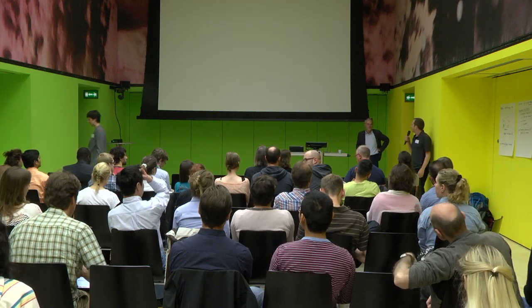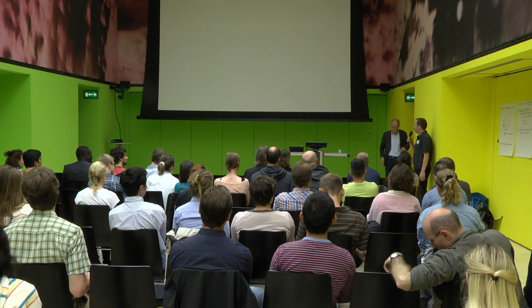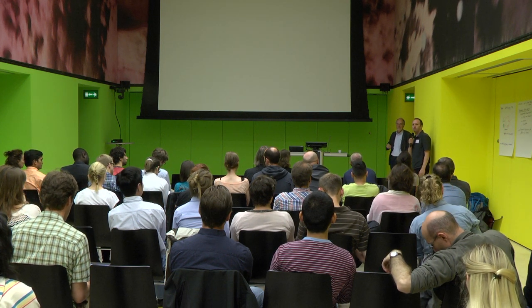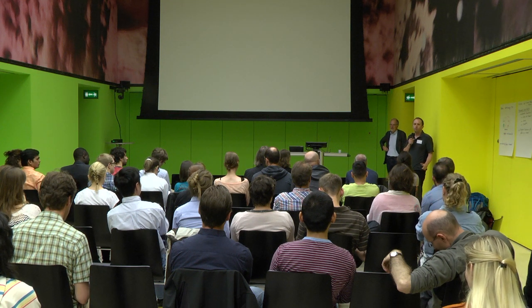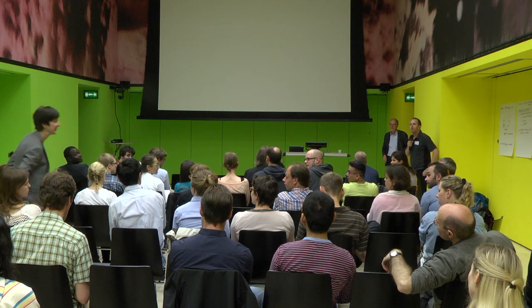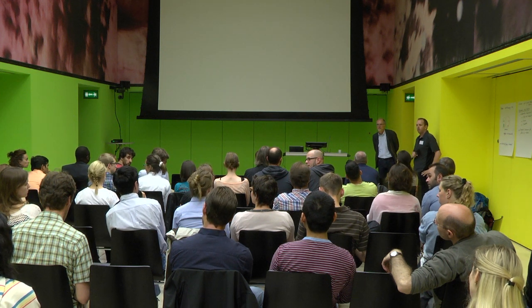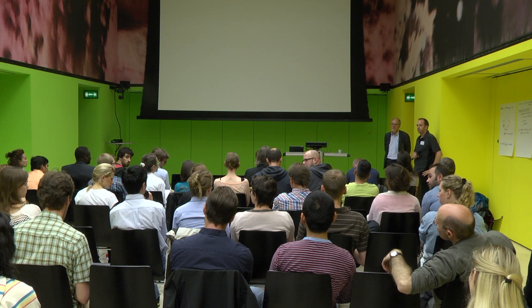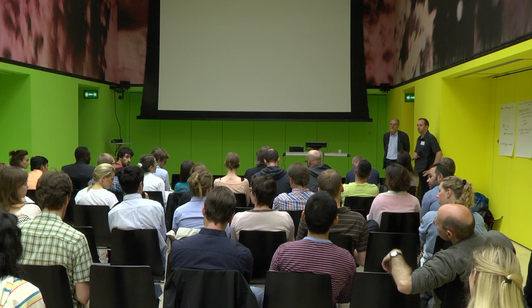So fantastic. Thanks, Bruno, for this very clear, comprehensive introduction to PRM and also the benefits of being highly resolved in targeted proteomics. So do we have any questions? Yep. Yeah, would you mind taking the microphone? Thanks. I'm wondering whether PRM only applies to the Q Exactive, which is an Orbitrap system, or whether it also applies to QTOF?